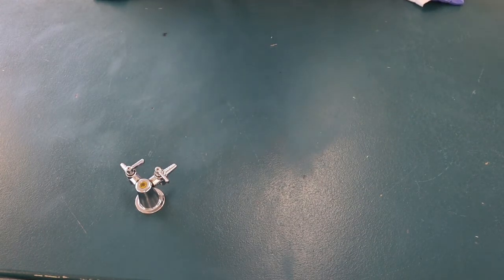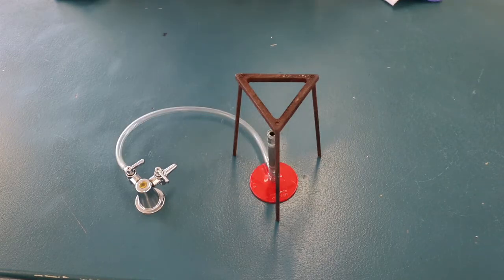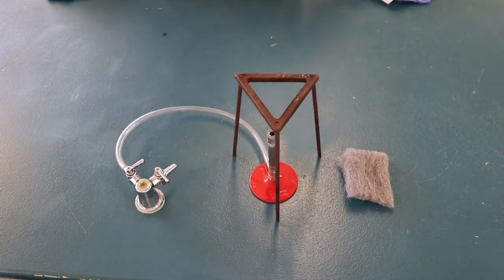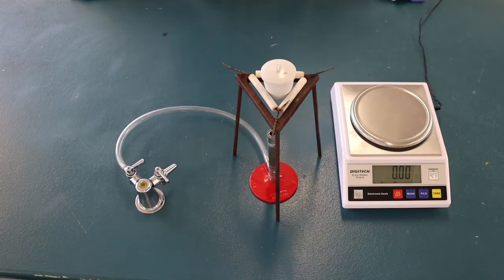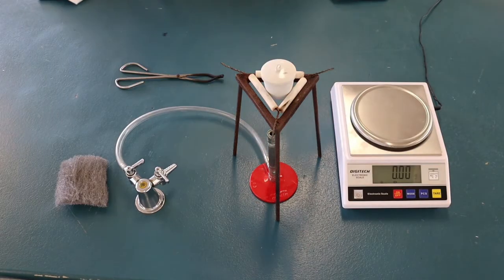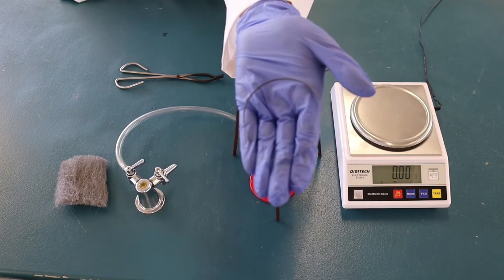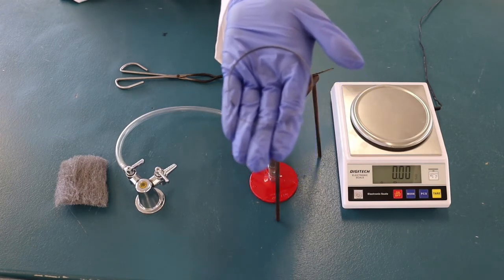These are the materials that you will need: a tripod, a Bunsen burner, steel wool, a pipe clay triangle, an electronic balance, a crucible and lid, crucible tongs, and a 20cm piece of magnesium ribbon.